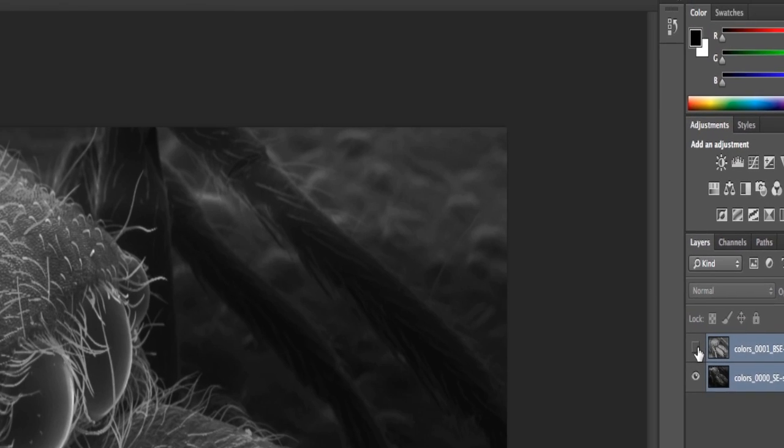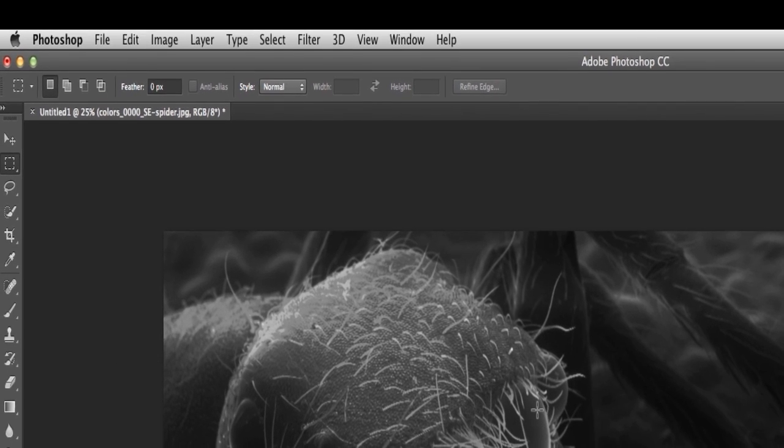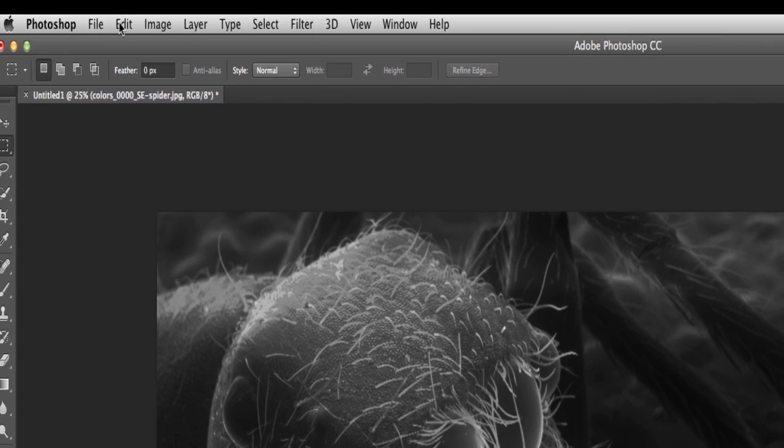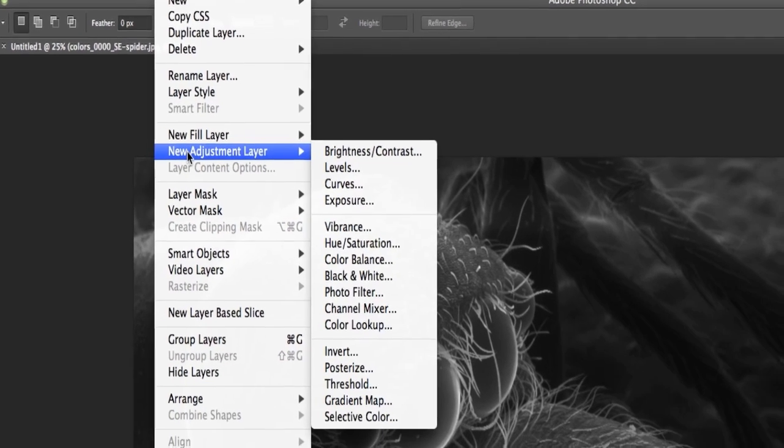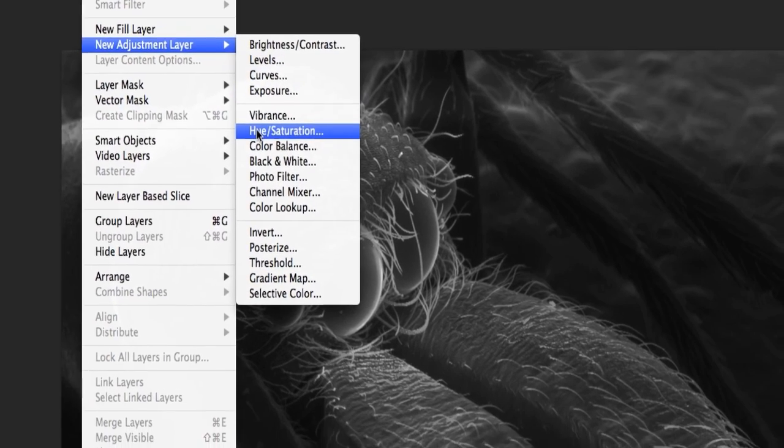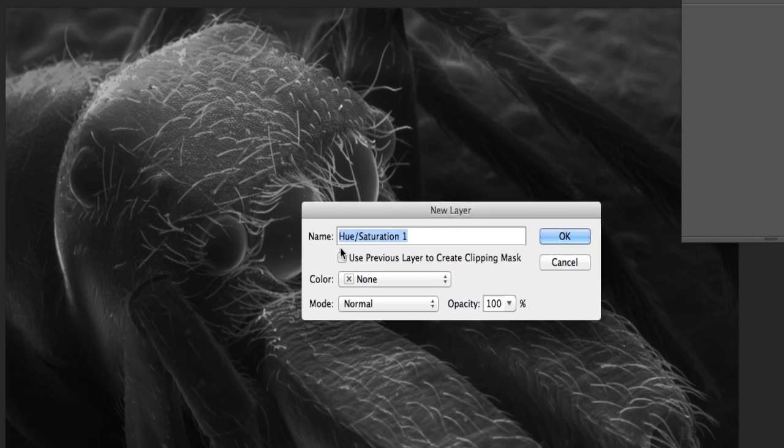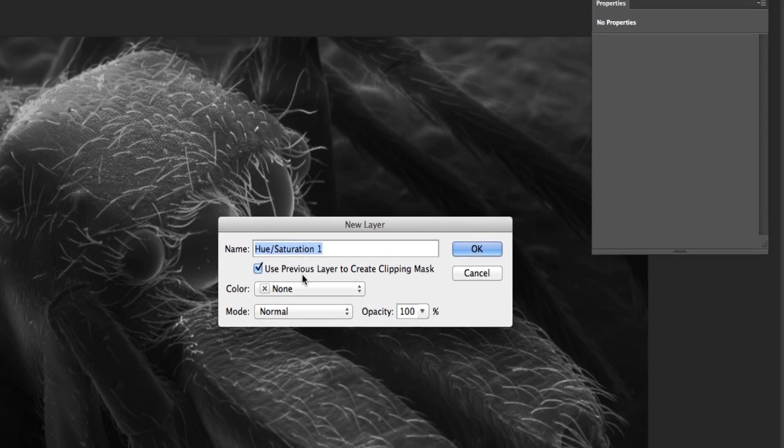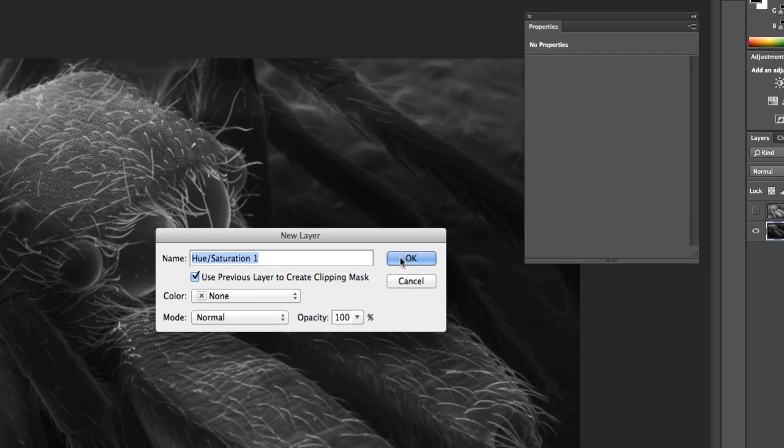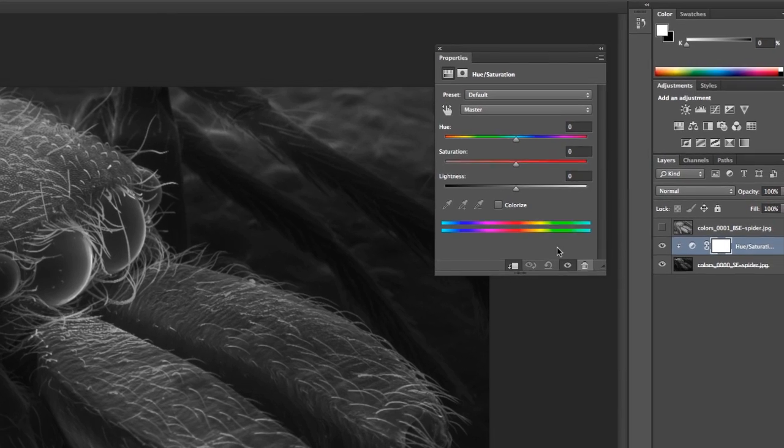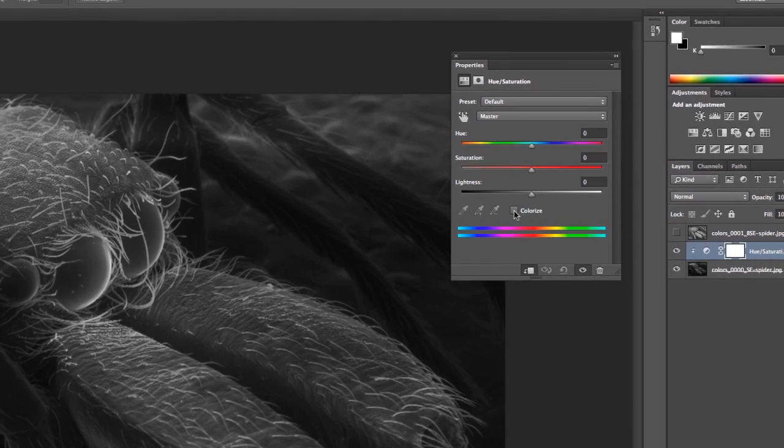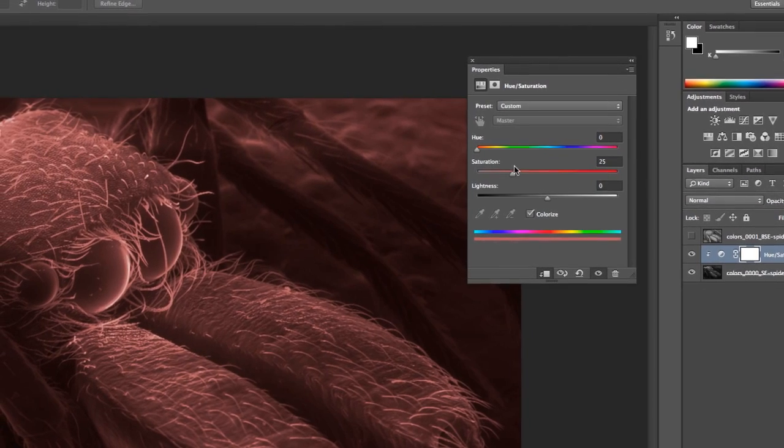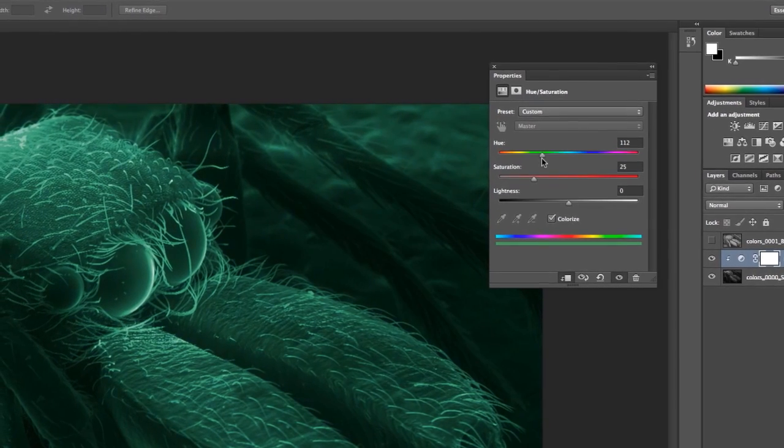So I'm going to go down to the base layer, and I'm going to apply some colors. And to do this, I come up here to Layer, and I'm going to say New Adjustment Layer, a Hue Saturation. And I'm going to link this to the layer below by clicking this little Use Previous Layer to Create Clipping Mask. And I say OK. Now at this point, I'm going to apply a color to the base layer, and I have to hit this little Colorize button here. And now if I adjust the hue, it'll take that hue and apply it to the base layer.